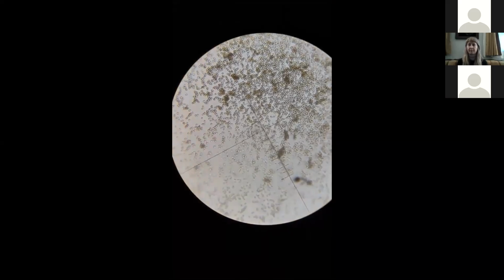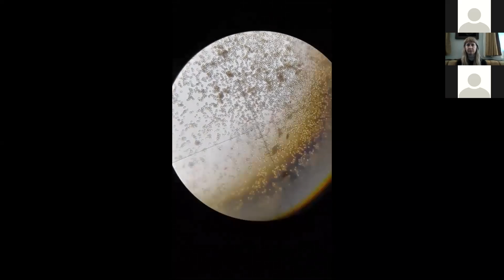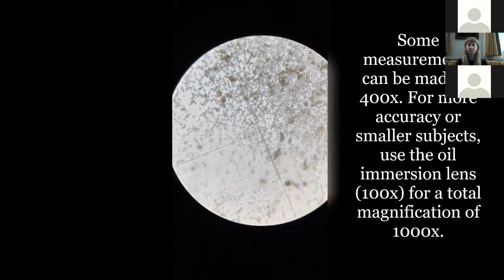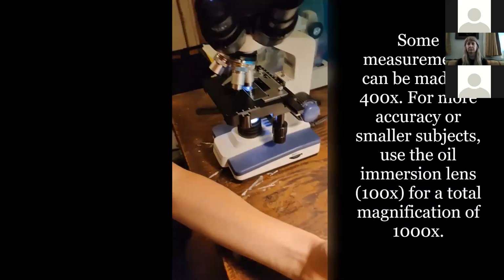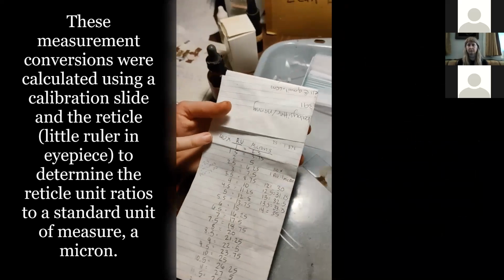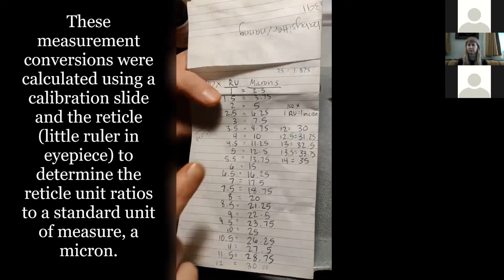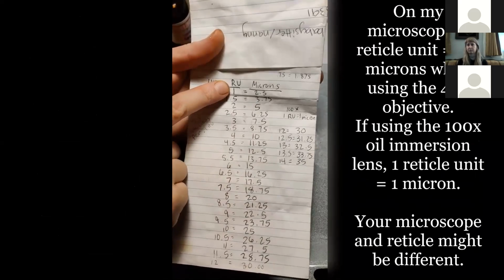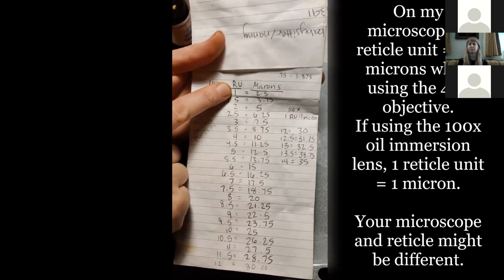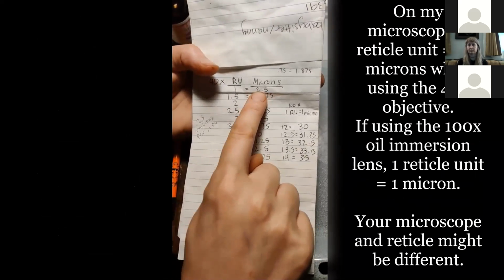And because we're looking at them under 400x, that's not a 1-to-1 ratio with the little ruler. So I have a cheat sheet here. I'm going to show you. So when I am looking at the microscope under 40x, 1 RU, that's a reticle unit, that's the little ruler I'm looking at through the eye, is 2.5 microns or micrometers.